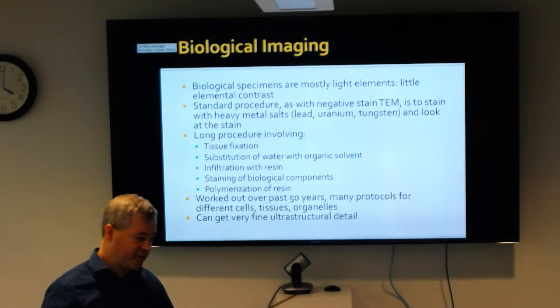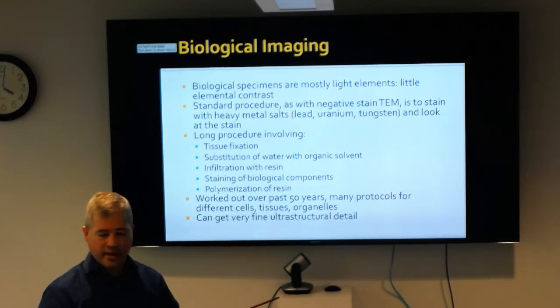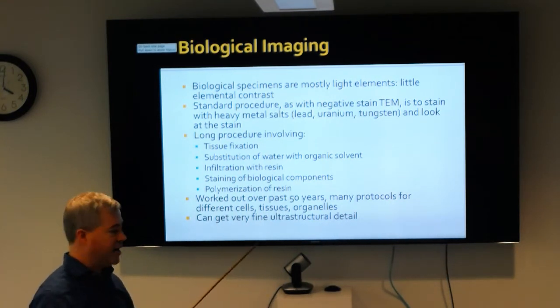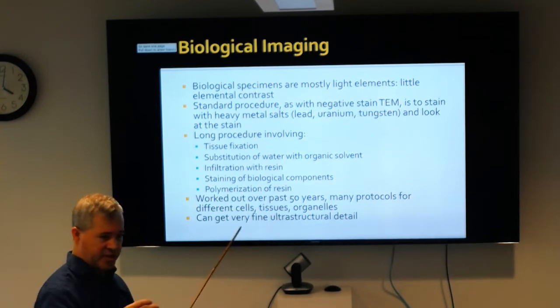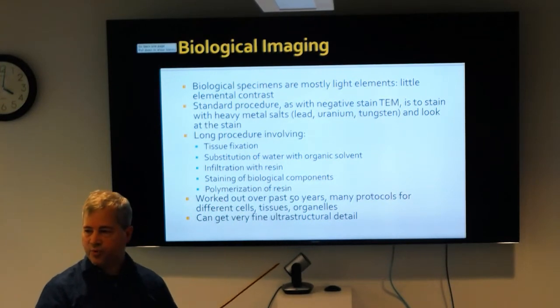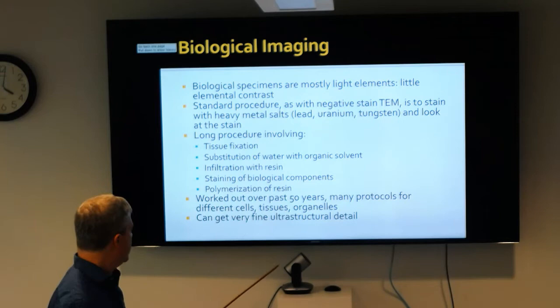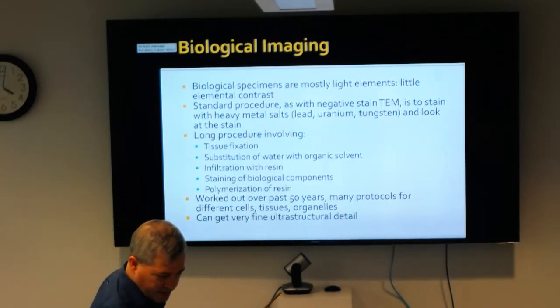But if you're looking for other elements, you'll maybe enhance other things. One disadvantage is that you're not looking at what's directly there like you do in cryo, but at what's been stained and fixed. So there can be a bit of a worry that you did it right, that you didn't cause some sort of deformation of the cell. You do have to be careful of that. But you can get extremely fine ultrastructural detail from this technique.